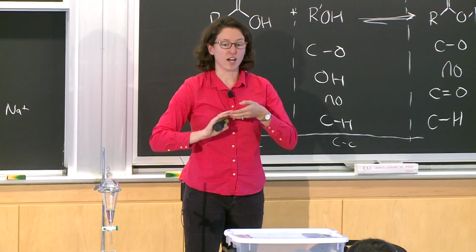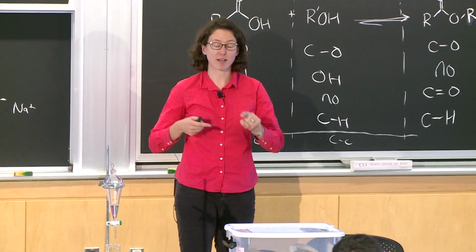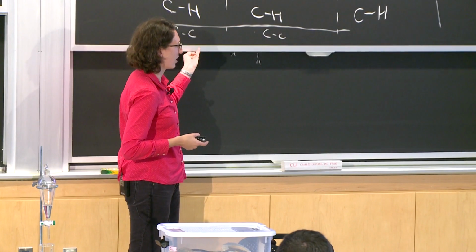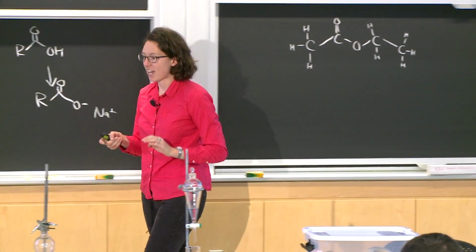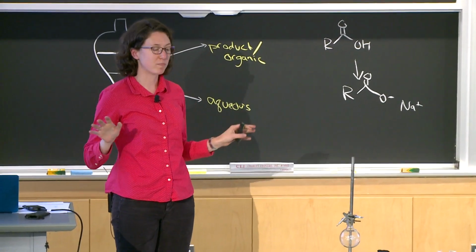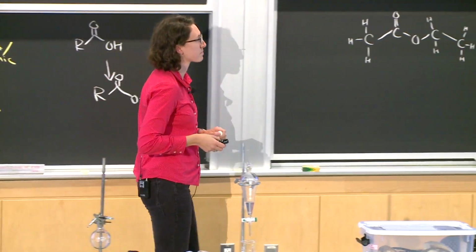Unfortunately, that lecture will happen after some of you take these spectra in the actual lab. So I will do a quick briefing on NMR because we have some time. And then again, stay tuned. You will get a much better idea of this technique from Walt in a couple weeks.